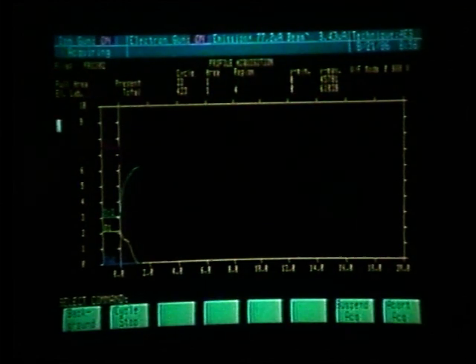We can also see that we have baseline resolution, meaning that when the carbon peak is gone, it drops to the exact baseline, meaning that the peak minus background is either 0 or a negative number. Same way with oxygen. We have a little bit of oxygen in the beginning, but once we sputter through that oxygen, we find it dropping to 0, meaning peak minus background is either 0 or a negative number.